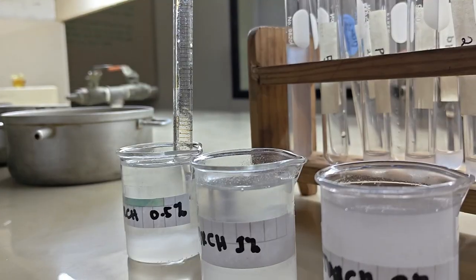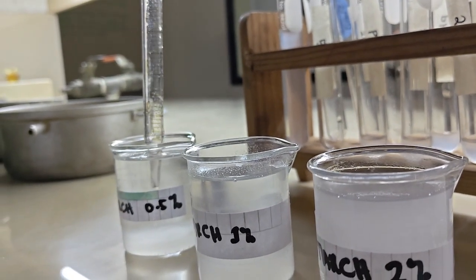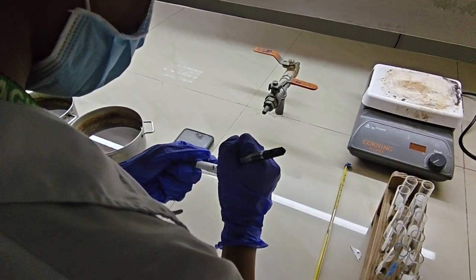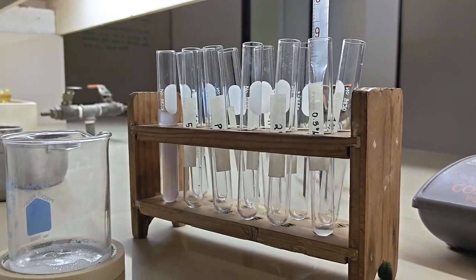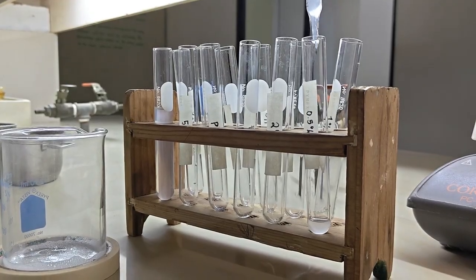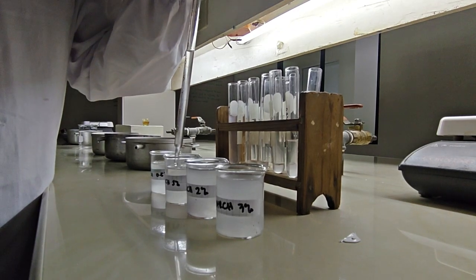Good day, everyone. Today, I will present our laboratory activity entitled Kinetics of Salivary Amylase, Effects of Temperature, pH, and Substrate Concentration. Salivary amylase is an enzyme found in saliva that begins the digestion of carbohydrates in the mouth by breaking down starch into simpler sugars.